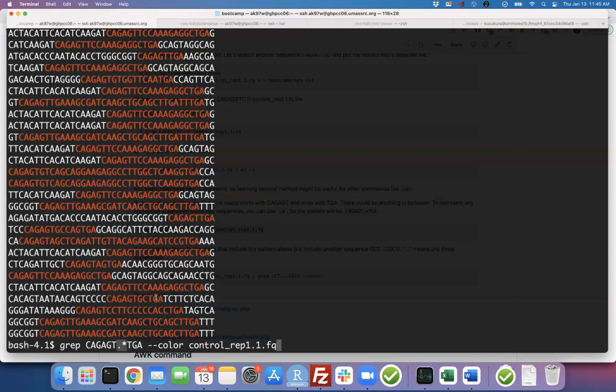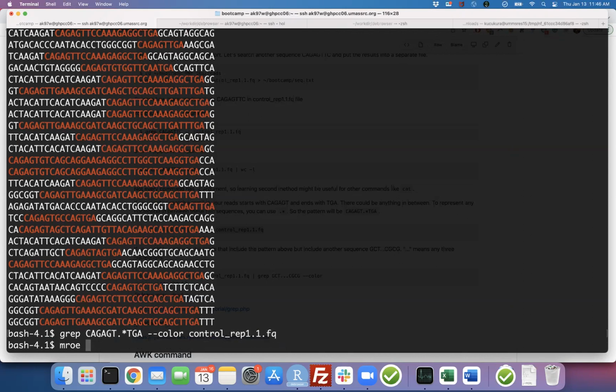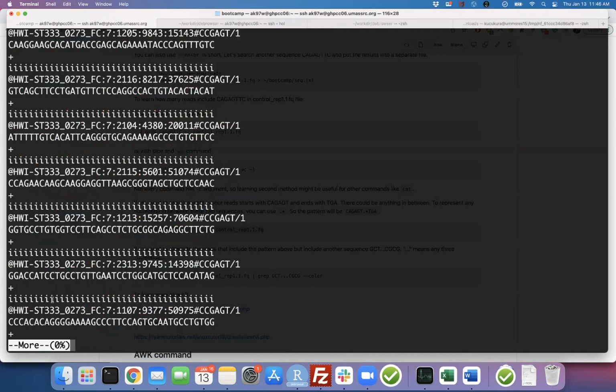You're not using this just to check or do the operation, because what we usually do, even with this barcode, is allow some mismatches, and you don't know where the mismatch or error is, because these are not always exactly these sequences. When you sequence, there can be some errors coming from the sequencing machine. And next week you're going to see that in these files that we're going to mention, you have the ID of the read, you have the read, and you have the quality line here.